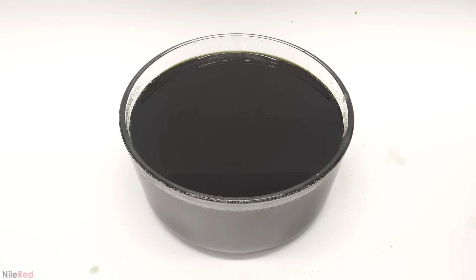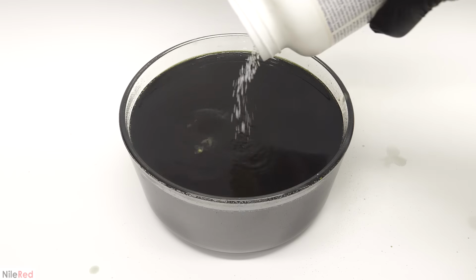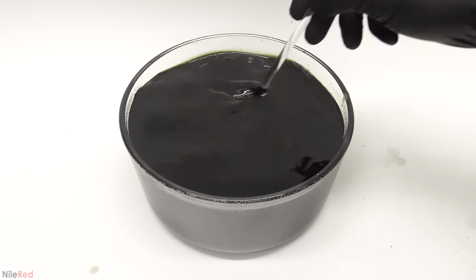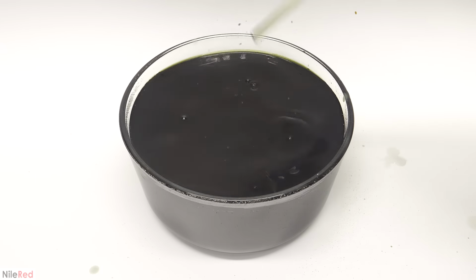The safe thing to do would have been to transfer it to a bigger container, but I decided that it was more fun to add solid sodium hydroxide. This would help prevent the volume from increasing, but it generally isn't a great idea because sodium hydroxide alone generates a lot of heat when it dissolves into water. So that, along with the reaction with the acid, it could easily start generating enough heat to boil the water.